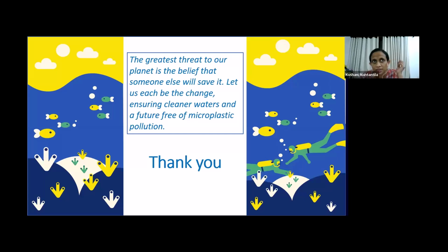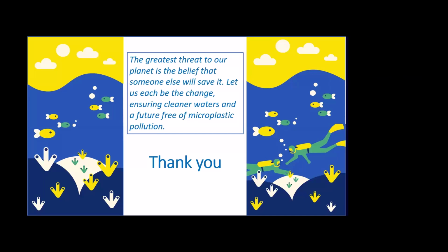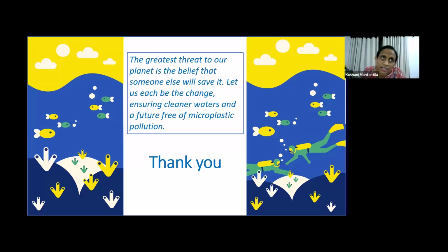But those methods are still very new, the use of such methods and the quality assurance are not properly documented. And as far as I know, the spectroscopic and the GC procedures will be recommended by the ISO standard in future.